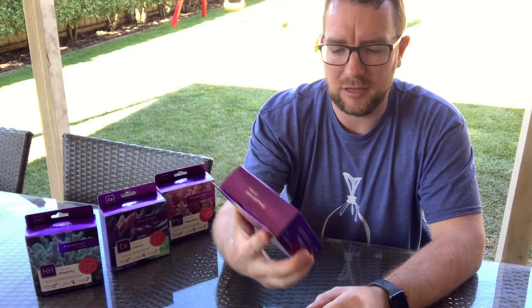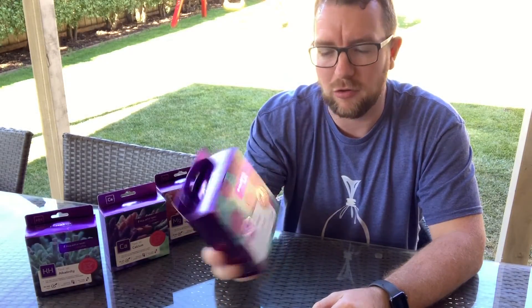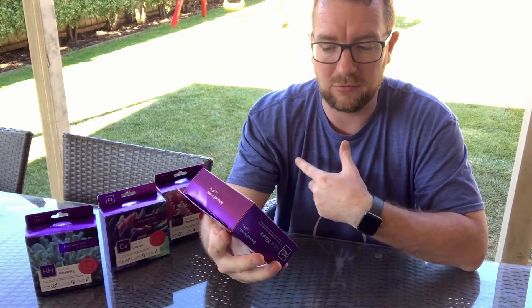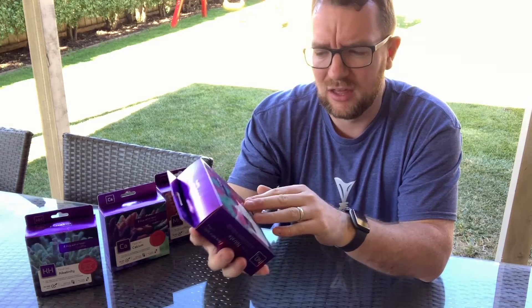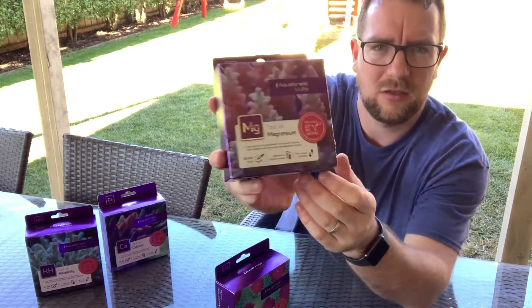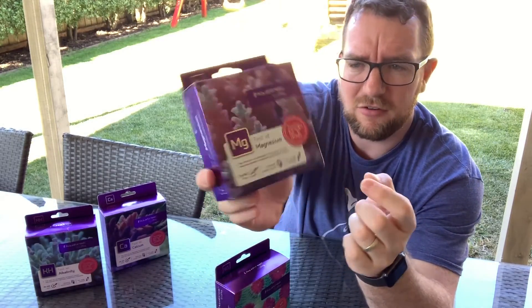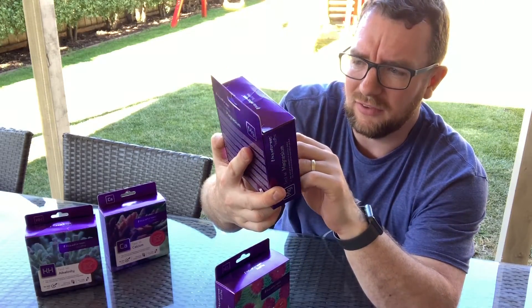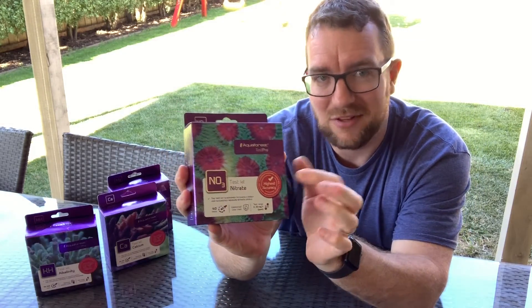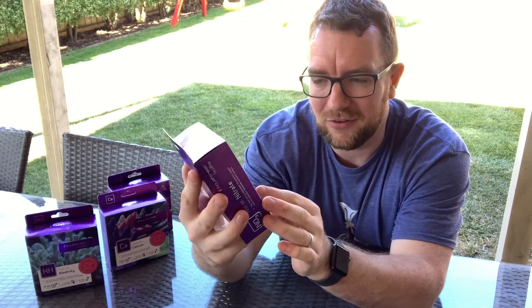First up, let's look at the Aquaforest Test Pro Nitrate Test Kit. First thing I noticed with the packaging on these two new ones — where the older kits say 'ICP verified certificate inside,' these new ones say 'highest accuracy' but don't come with a reference solution, though they are ICP verified.